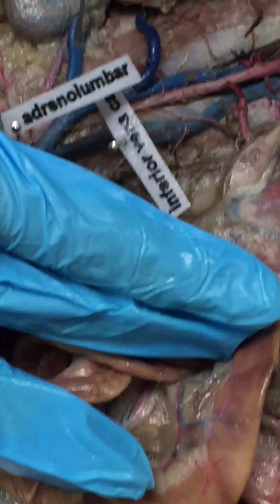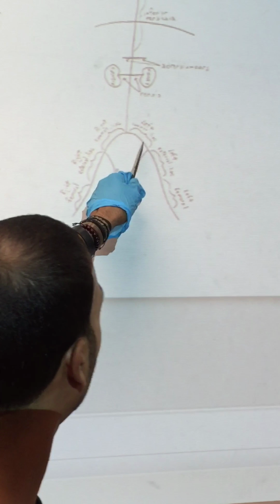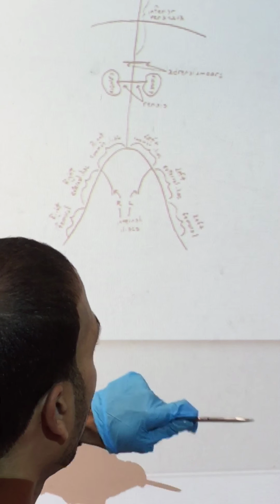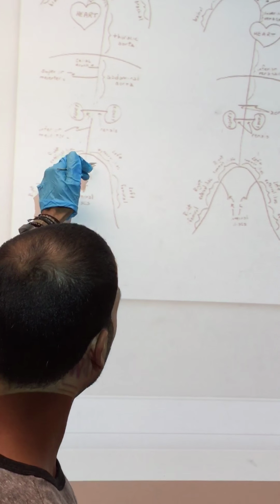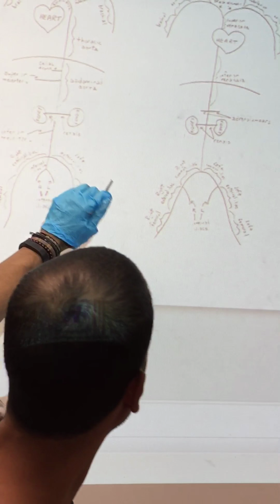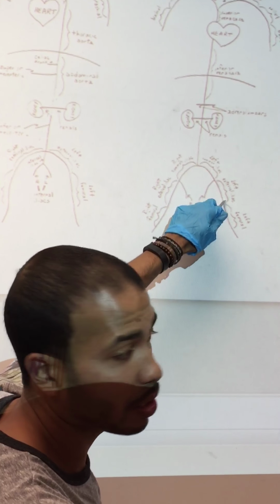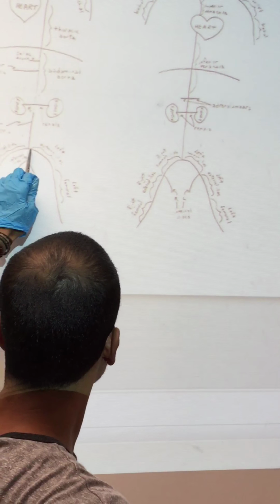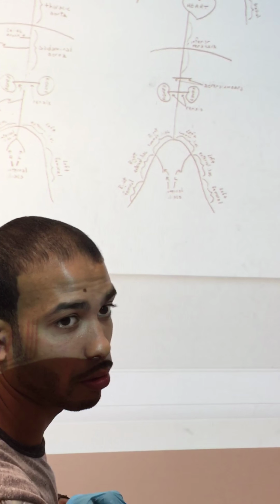So, inferior vena cava, then goes down. Okay, so before we look at that, inferior vena cava goes down and branches off to your left common and right common iliac. The important thing about this, if you note, look here, you have iliacs for your arteries as well. The difference is, in veins, you have a common iliac, then the external iliac. In arteries, you just have your left external and right external iliac leading to the femoral, okay?